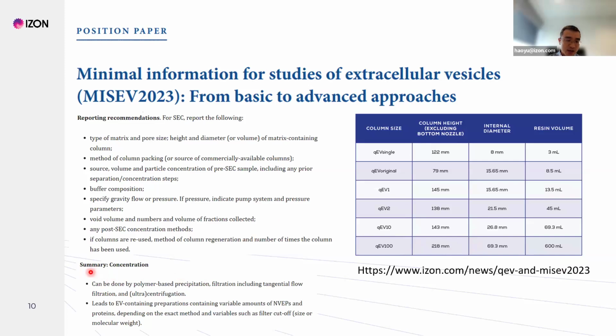Also, to mention a small thing here, you see it mentions that membrane-based methods, for example filtration, are just considered as concentrating methods. So it's not a purification method. You can use TFF as the concentrating step, but you still need to use other methods for the purification, as it mentions.